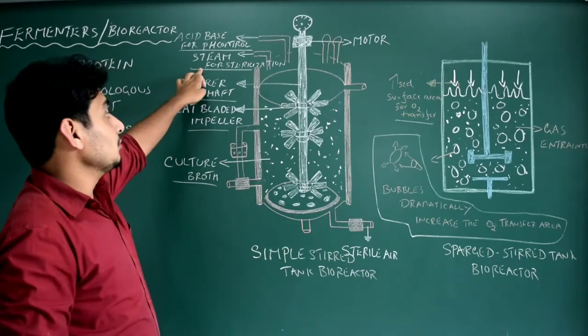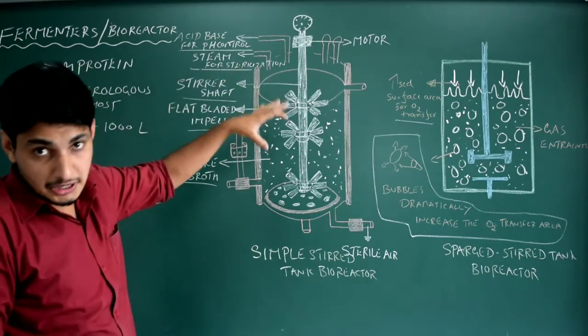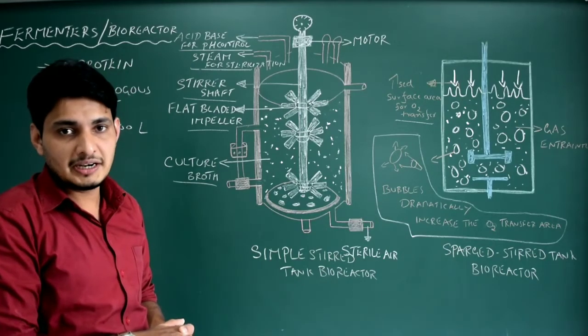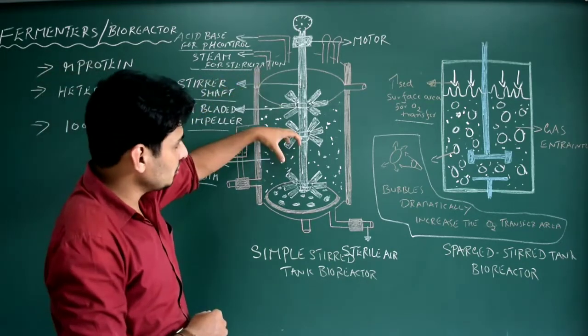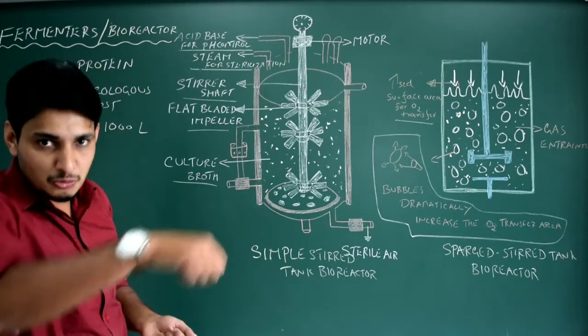Even steam for sterilization is also required, because once you put the culture into this tank, there is a chance of contamination. So we have to maintain aseptic conditions. That is quite challenging actually. Once we put it, obviously we need to mix it every day. That is agitation. So we need to mix it.